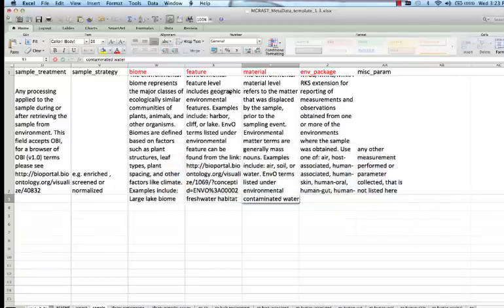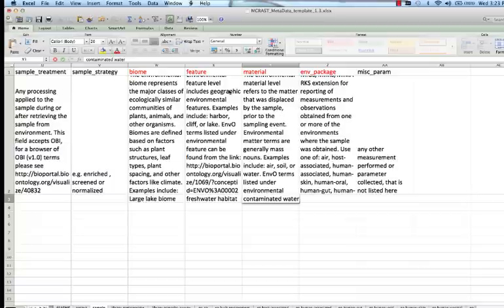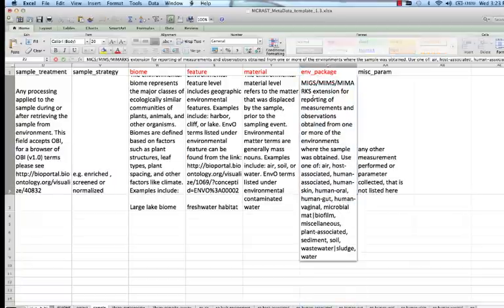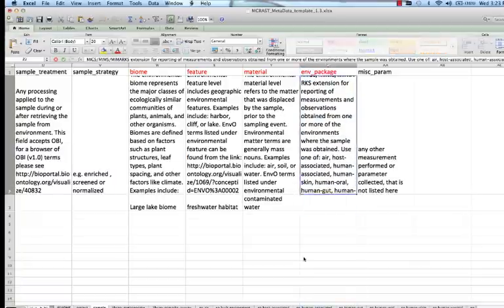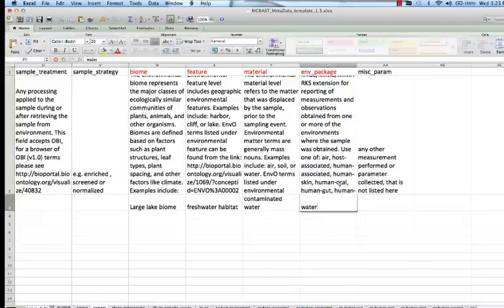Lastly, specify an appropriate environmental package for your data. Use one of the EP names from the second row exactly as it appears.